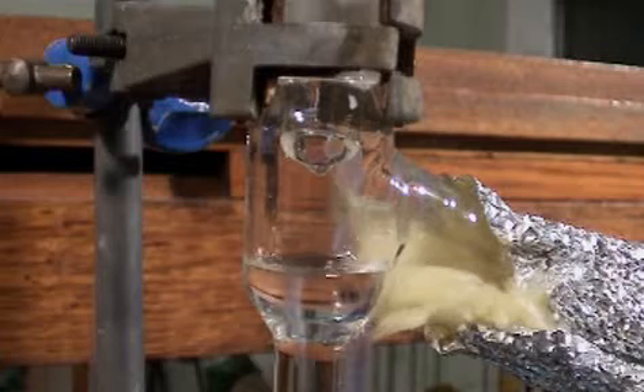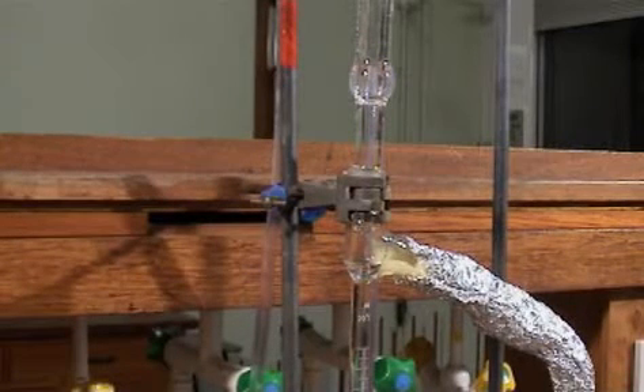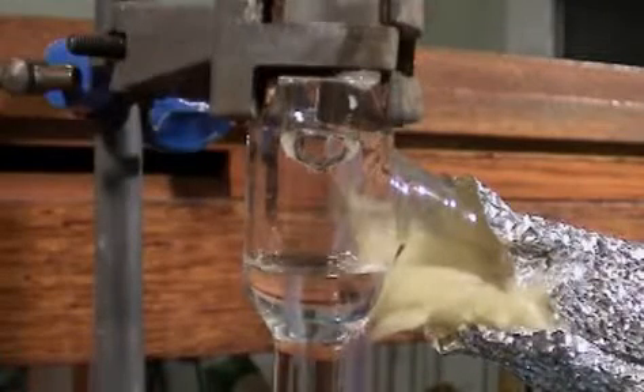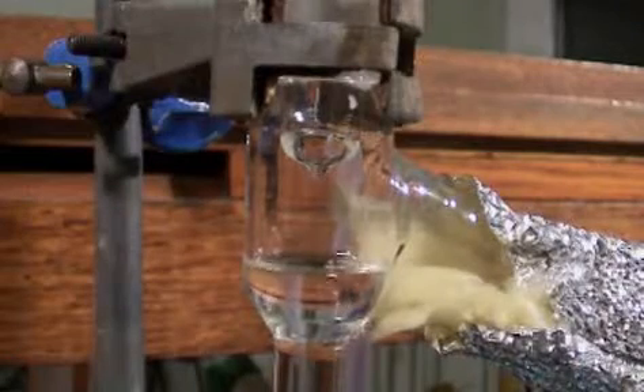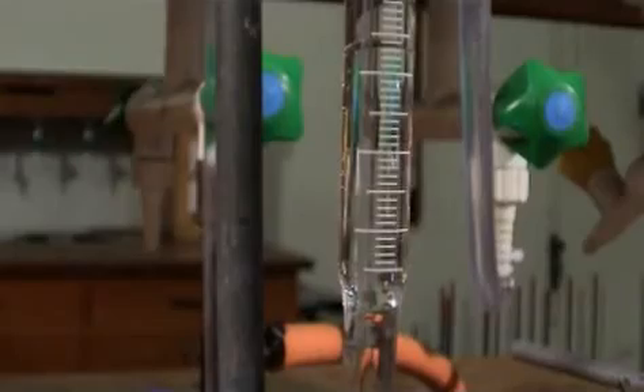We have a reaction which is producing water. And because the products are in equilibrium with the starting materials, we need to remove the water in order to drive the reaction to completion. We're using a solvent which forms an azeotrope with water. Toluene is a very good solvent for that purpose. As the azeotrope condenses and drips into the sidearm, the water separates and falls to the bottom, and the less dense solvent stays at the top.